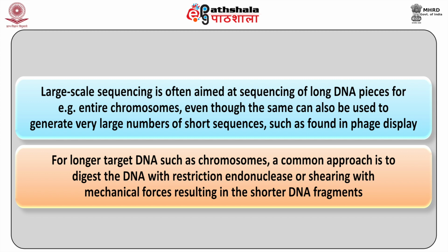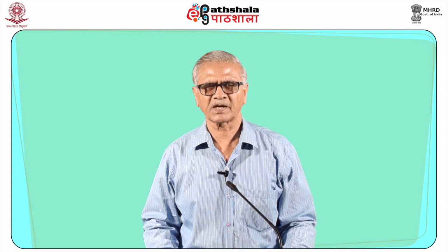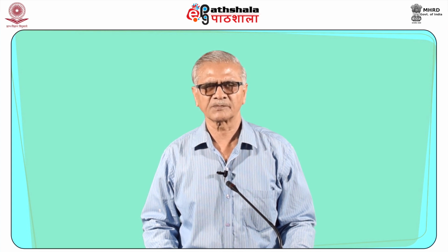For longer target DNA such as chromosomes, a common approach is to digest the DNA with restriction endonuclease or shear it with mechanical forces, resulting in shorter DNA fragments. The fragmented DNA can be cloned in a DNA vector and amplified in a bacterial host such as E. coli. The short DNA fragments are then purified from individual bacterial colonies and sequenced in isolation, which are then assembled and overlapped into one long continuous sequence.